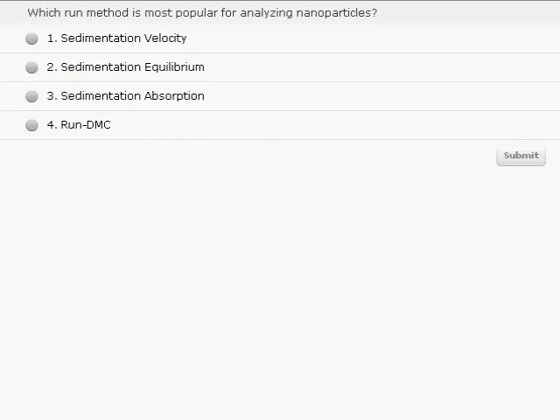All right, let's see what the poll results are. The majority of people did get the right answer. Sedimentation velocity is the most popular for analyzing nanoparticles, and some people are having fun with me and selecting run DMC. So I'd like to think that you're just pulling a joke there.